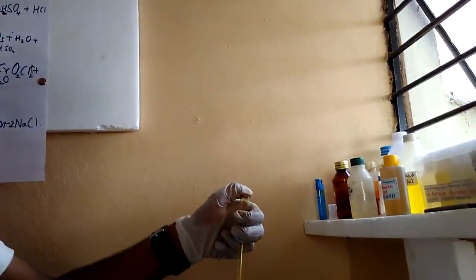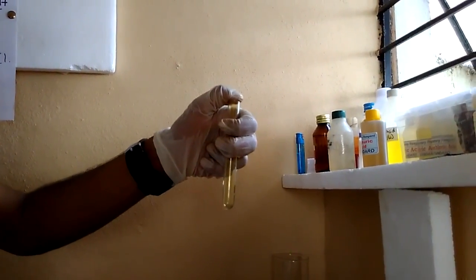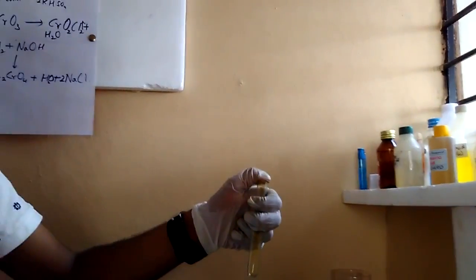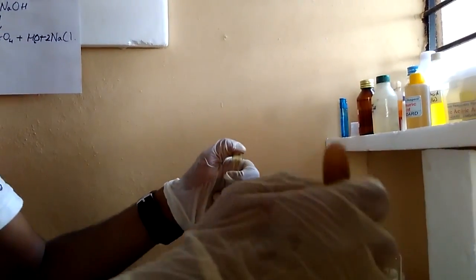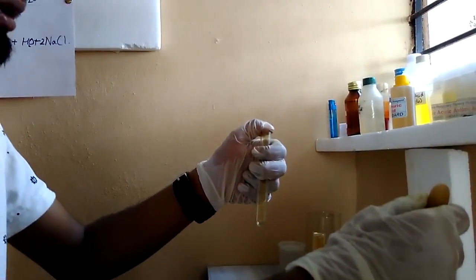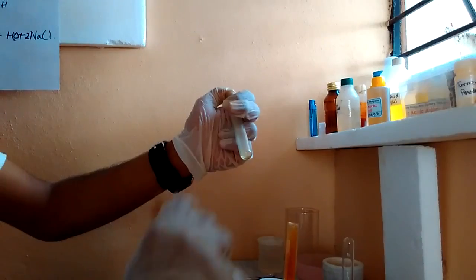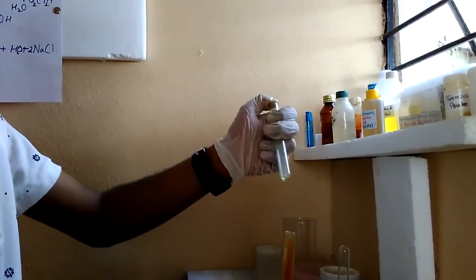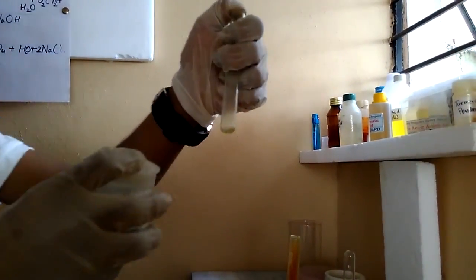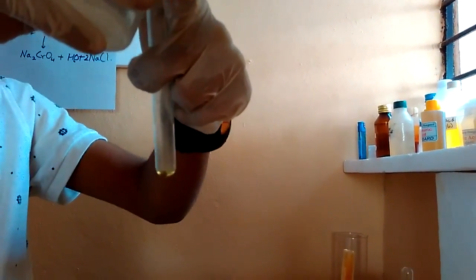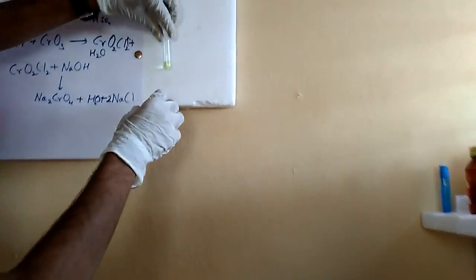I will be adding some sodium hydroxide. You can also add the sodium hydroxide to the same test tube in which we carried the reaction, but I wanted to add it to a separate one so that you get a good volume to see. You can see that at the bottom there is the formation of a yellow colored solution. Add some water so that you can see it better. You can see that there is the formation of a yellow colored solution — that is nothing but sodium chromate. Sorry — sodium chromate.